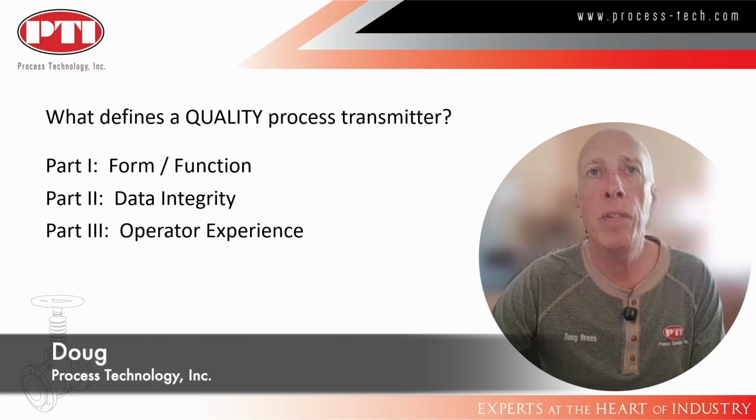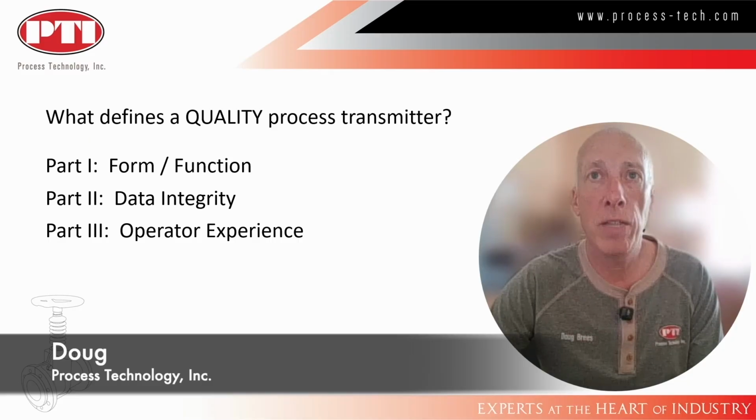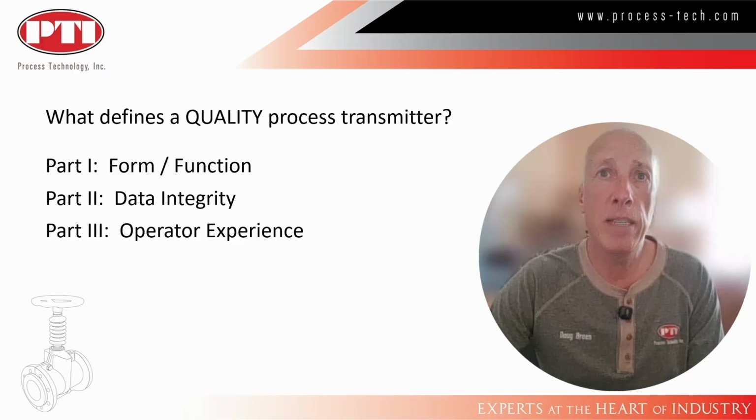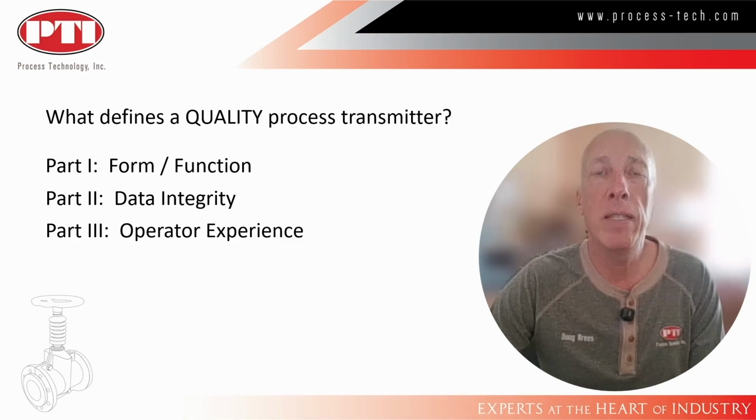Question of the day, what defines a quality process analyzer transmitter? There's enough to talk about that I've broken this into three parts. In the previous session, if you saw that, we talked specifically about the form and function. Let's get busy and dive into data integrity.